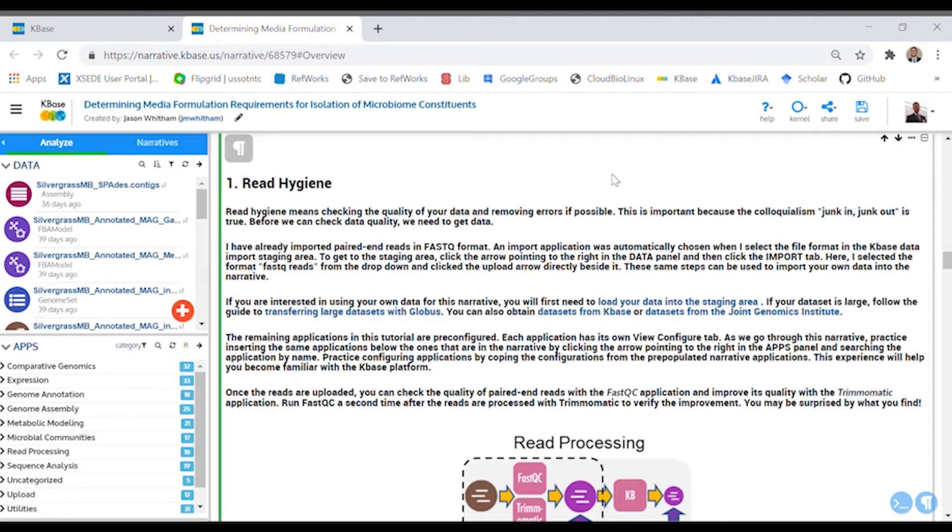This read hygiene cell is the beginning of the first section of applications. In this section, you'll learn about importing your sequencing reads, evaluating their quality, and trimming them.